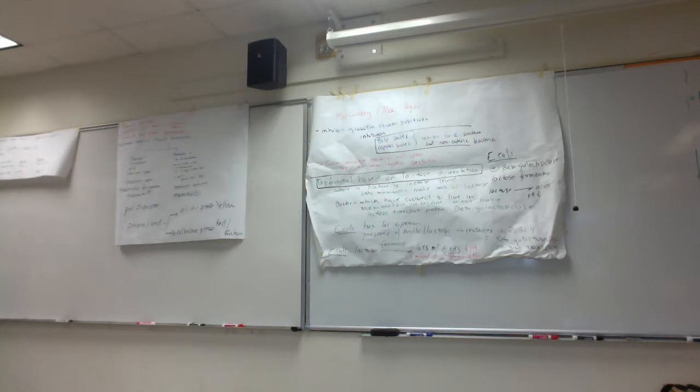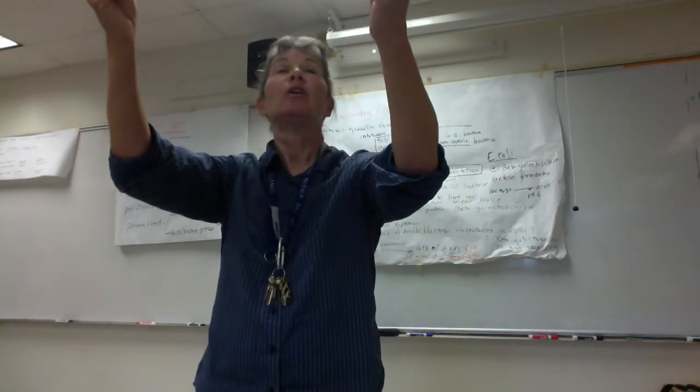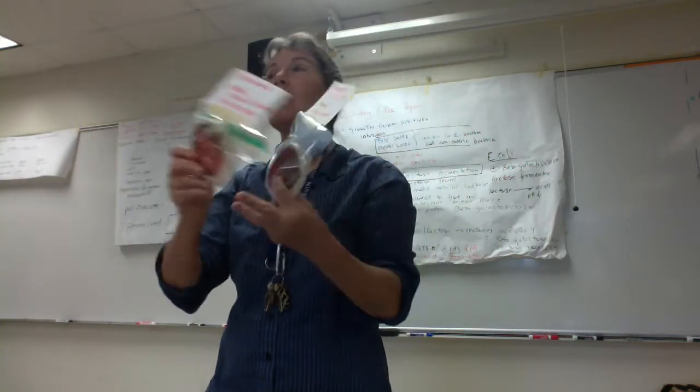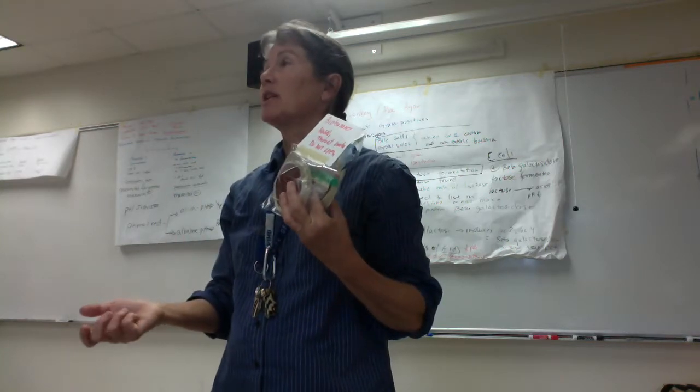Another possibility, folks, is that if we're colonizing our nose with Staphylococcus aureus, which is also beta hemolytic, there is a possibility maybe from post-nasal drip that you are getting some Staph aureus in the back of the throat. So maybe we're picking up some beta hemolytic Staph aureus. We can do a Gram stain and find out just based on cell arrangement, okay? So, beta hemolytic Streptococcus pyogenes, beta hemolytic Staphylococcus aureus, right?